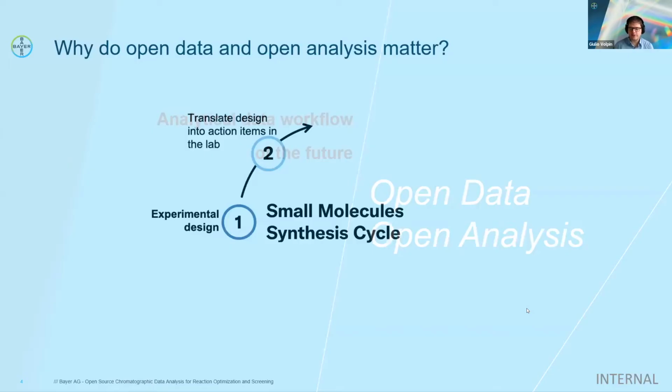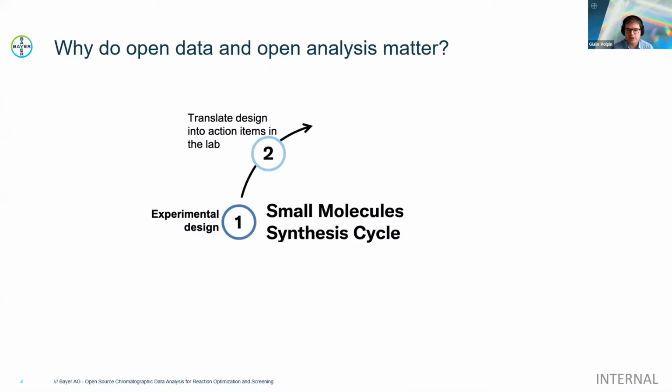And it is definitely true that this type of considerations can apply to each part of the discovery cycle that we perform in chemistry, right? If you don't translate your experimental design, your idea, properly into a procedure and don't specify exactly what your addition time should be, what your temperature of the jacket or your temperature inside the reaction should be, your stirring speed or shape of the stirrer should be, of course, there are a lot of possible failure points and uncertainty points. But what we really saw is that there is one part of this cycle that was until now overlooked.